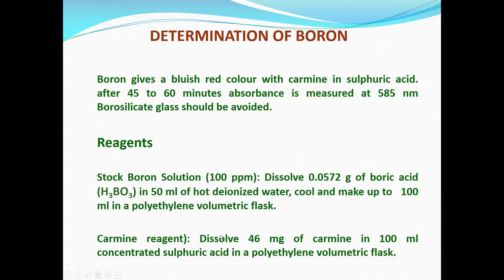So, Carmine reagent, how do you make it? Of course, you cannot synthesize all organic compounds in the laboratory, that is understood. Therefore, what you should do is buy it. These reagents are available off the shelf with chemical suppliers.